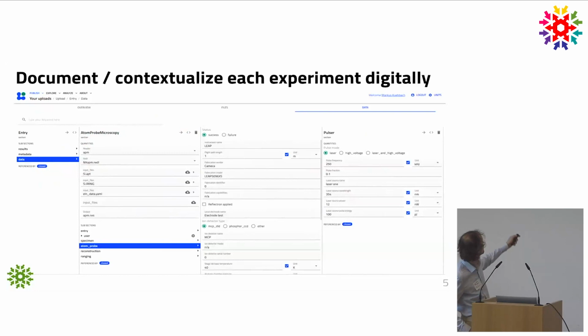You have this mask that is configured quite extensively here. Now people always ask me, is this necessary like this? Does it have to be so extensive? No. In principle, you could cut all of this out, put it in a text file and load it along the parsing process. That wouldn't be a problem. But here, for the sake of explicitness, I put it this way to show that all of the different capabilities that the custom ELN schema is capable of were very useful and can also be very useful for atom probers.